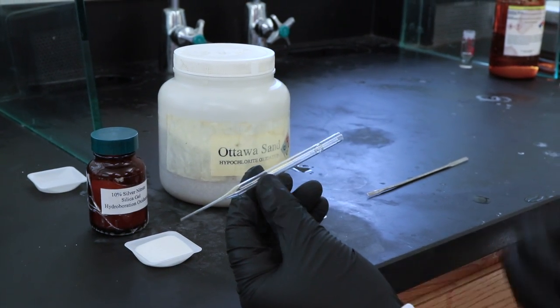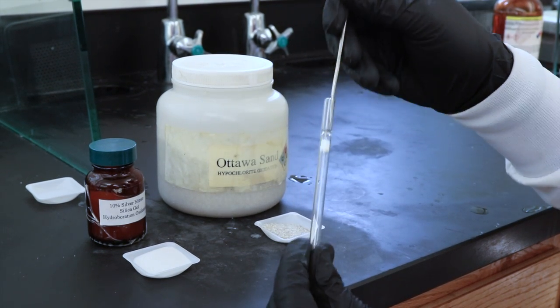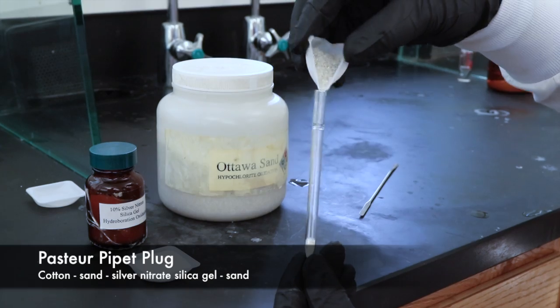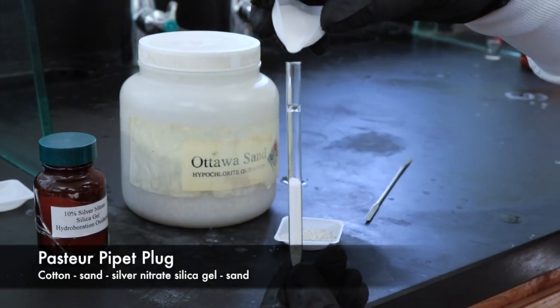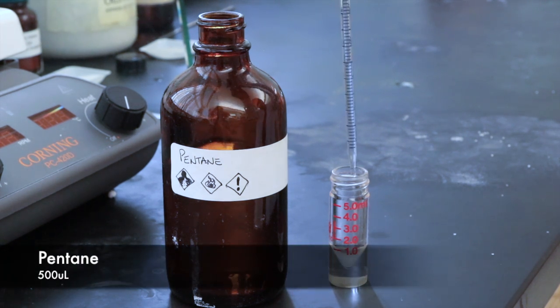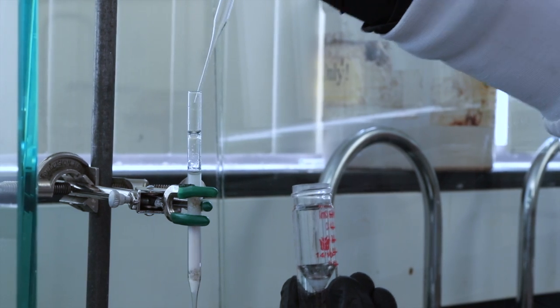I'll be setting up the plug using a Pasteur pipette, so I'm going to try and get this cotton to the bottom, which apparently is a struggle. After that, I'll add some Ottawa sand and then the crucial silver nitrate treated silica gel, and then at the top I'll add a little bit more Ottawa sand to finish it off. To the remaining product, I'll add 500 microliters of pentane and then take that solution and add it to the plug so we can then elute our product.